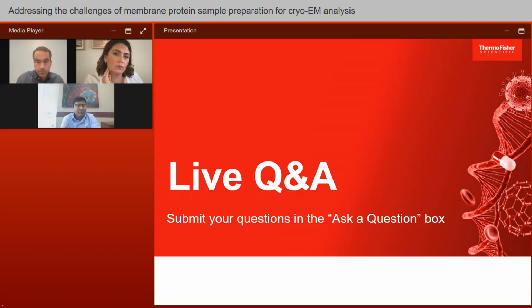All right, I think another Fab question for you, Rosie. There's a ton of them here. Let me start it. Were you able to collect and process any data without a Fab bound to your protein in terms of getting good 2D classes? That's a great question.